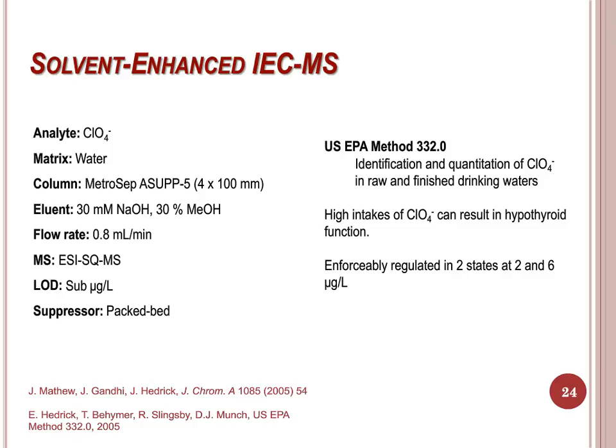It was possible to achieve detection limits for perchlorate in water at 0.02 micrograms per litre using large 200 microliter injection volumes and a quadrupole mass analyzer. However, as organic solvent in the eluent pre-separation can lead to unpredictable retention behaviour, for identification, naturally occurring perchlorate present in the samples was measured relative to an 18O enriched perchlorate internal standard to ensure reliable retention time reproducibility.